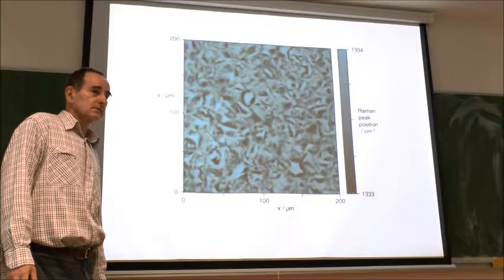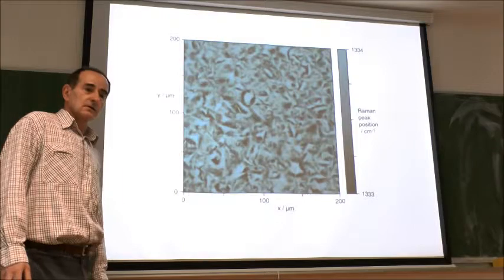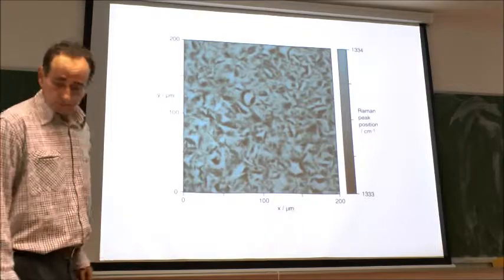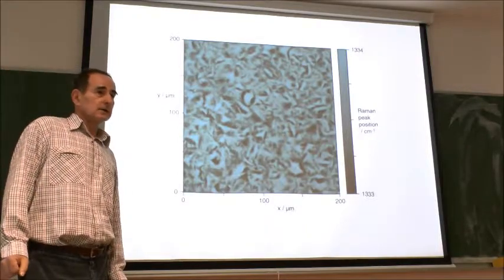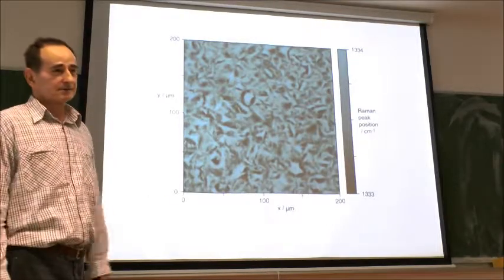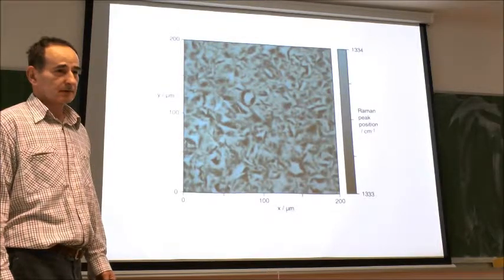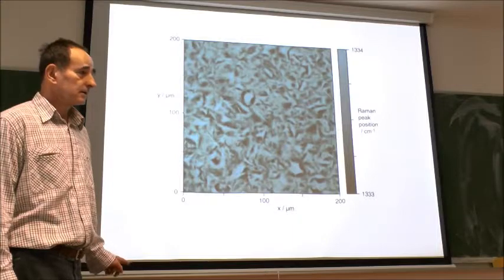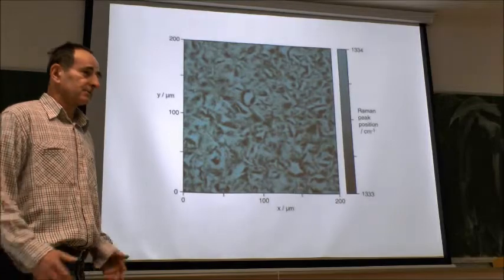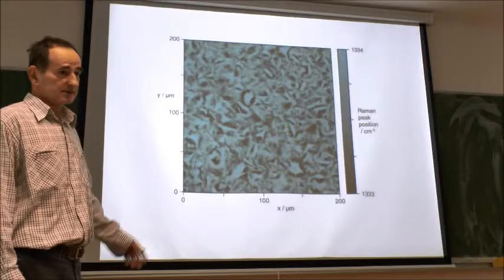You said that you measure 180 degree backscattering. How about solids? I mean, not transfer. So it's measured in that direction. There are no other options like 90 degrees here. Of course, there is an option, but you have to work on it yourself. At present, it's not available.